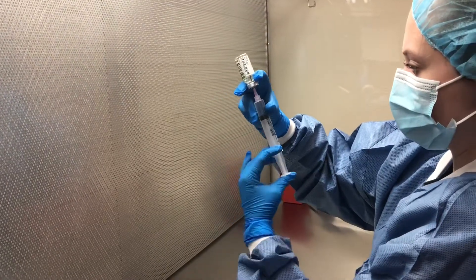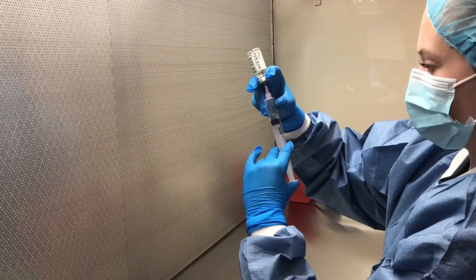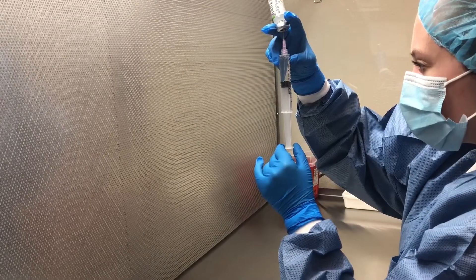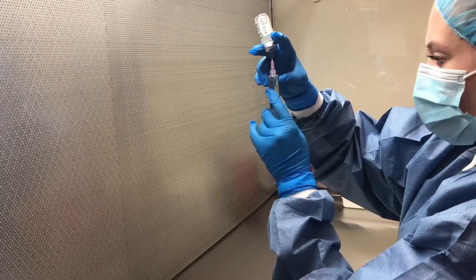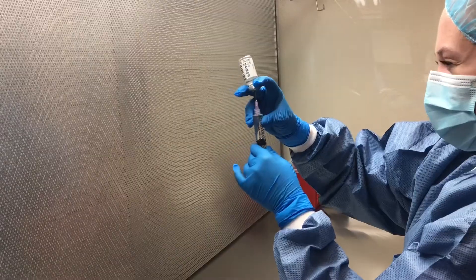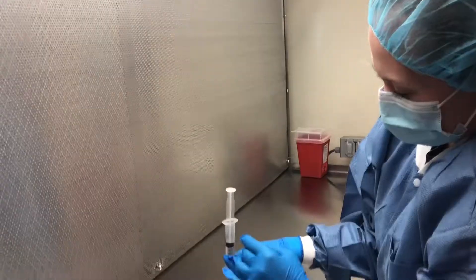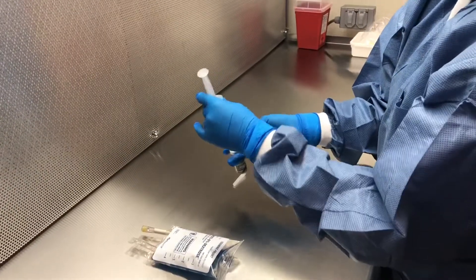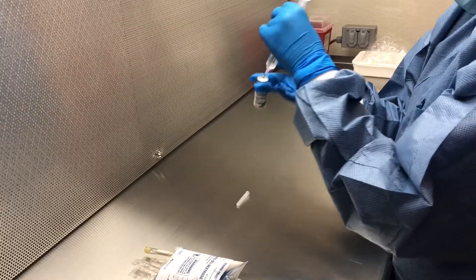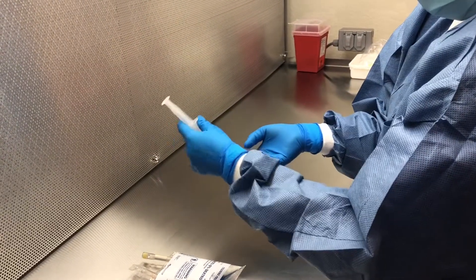Next, flip the vial over so that you can draw up your liquid — first inserting the air, and then slowly drawing out the liquid you need, double-checking as you go to make sure you have the right amount. After you have drawn up your solution, you might notice that you have a few bubbles in your syringe. Vigorously tap the syringe in order to get all the bubbles out. If you have bubbles that are hard to get out, you can flip the syringe over and use the bigger bubble at the top to get the smaller bubbles that are near the plunger at the bottom.